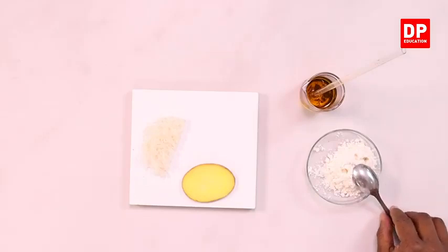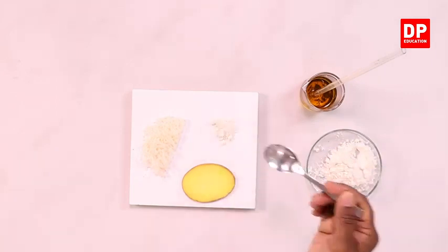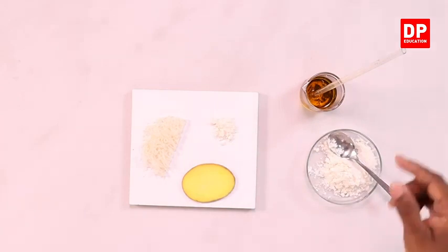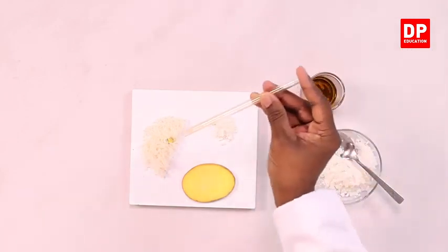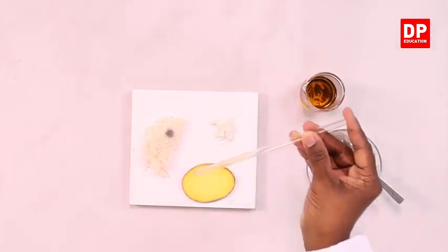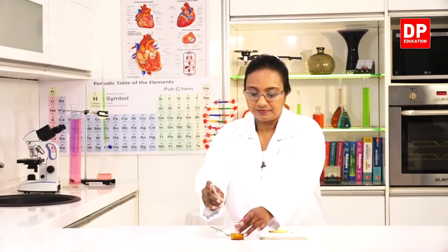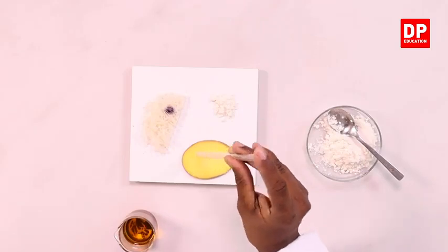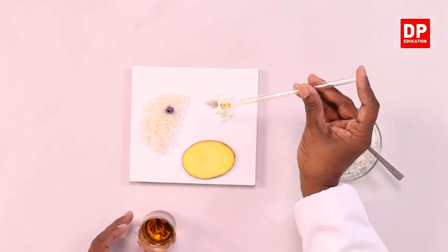Before I start the activity, I will also add a small sample of flour onto the tile. Here we are using a white tile, so you can see the color changes also clearly. Now I draw a drop of iodine and add it to the string hopper. Another drop of the iodine solution to the piece of potato and another drop to the flour.